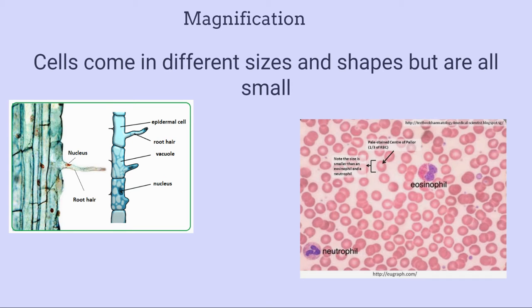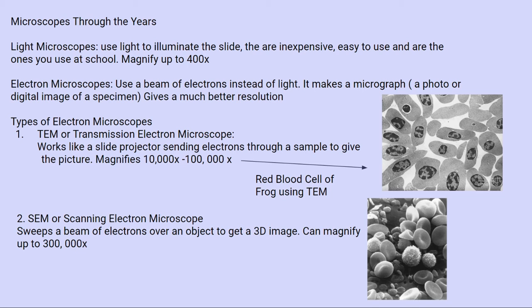So let's define magnification. Oh, I almost forgot, I forgot about one more piece to this, microscopy. I'm going to link an article on microscopy, sorry, it's not a video. You're going to read the article about microscopy. Not to confuse you, I added it in even though microscopy is not a microscope. It is actually the next step in the world of microscopes. It is super cool and awesome, and the best part is it's relatively new. 2019 was when they first started publishing about it, even though microscopy has been around for a long time. DNA microscopy, very, very cool. So read that article and then come back and watch the rest of this video.